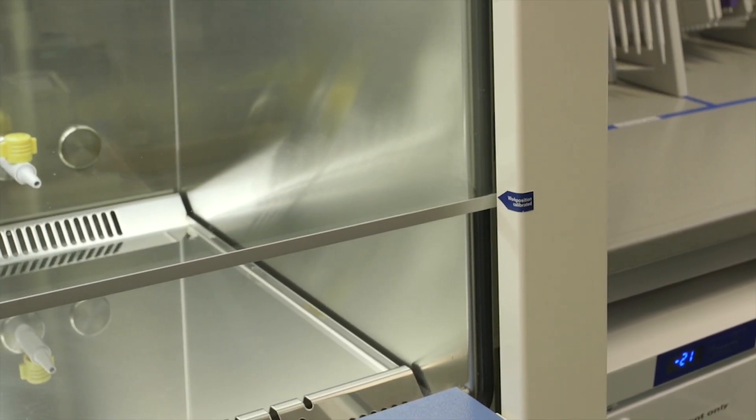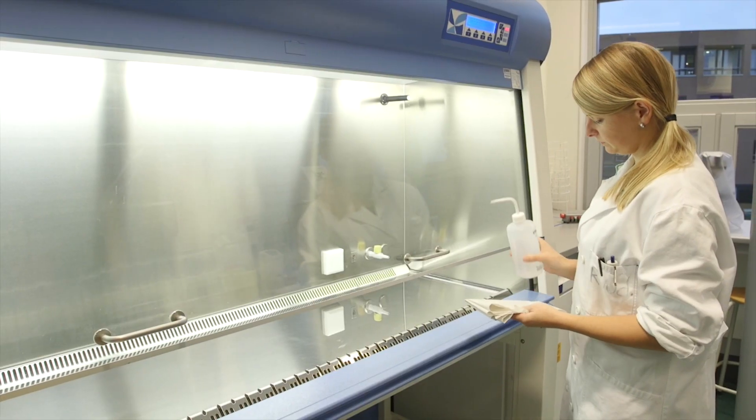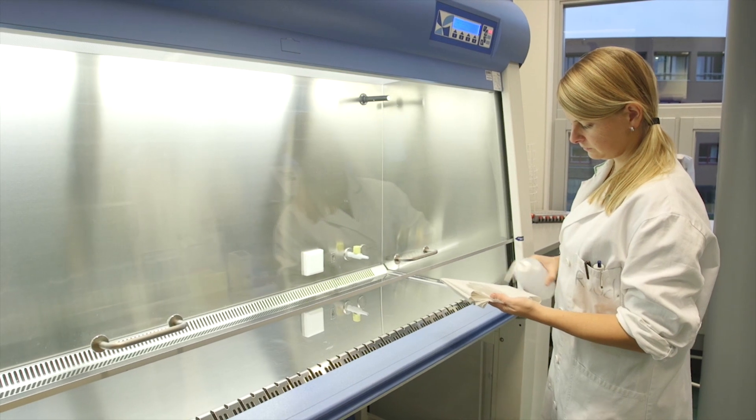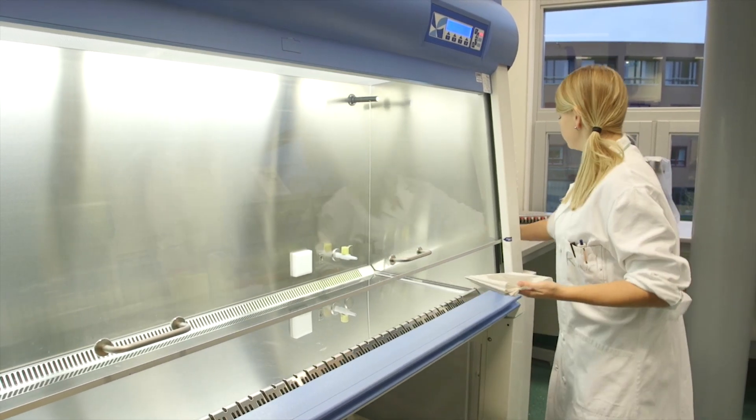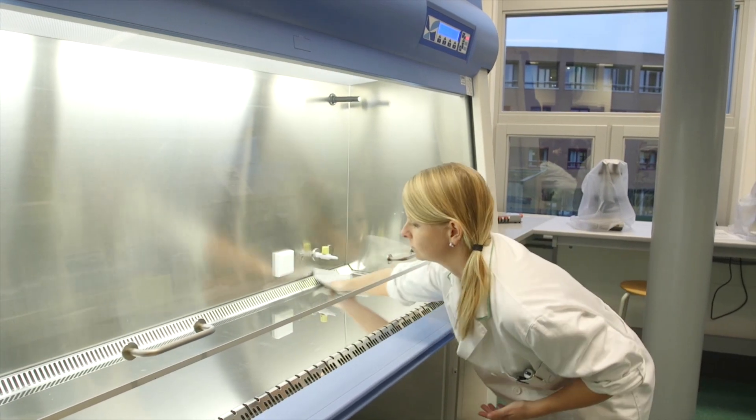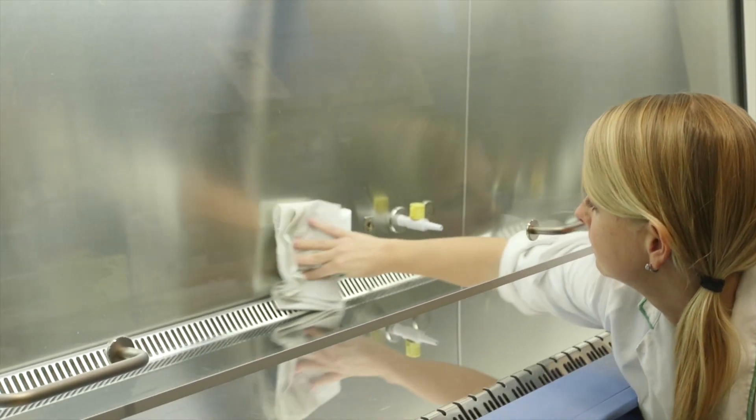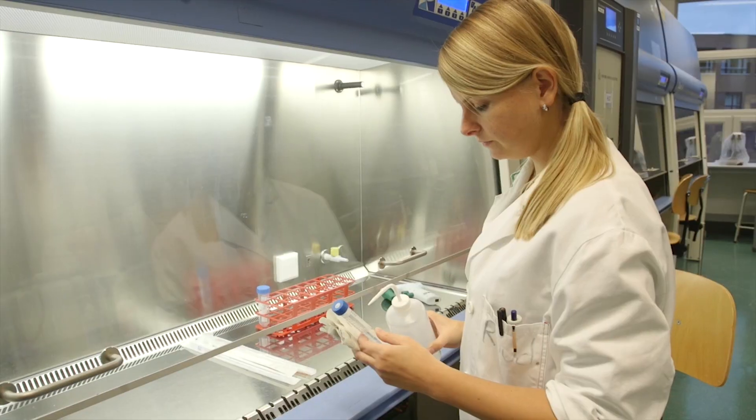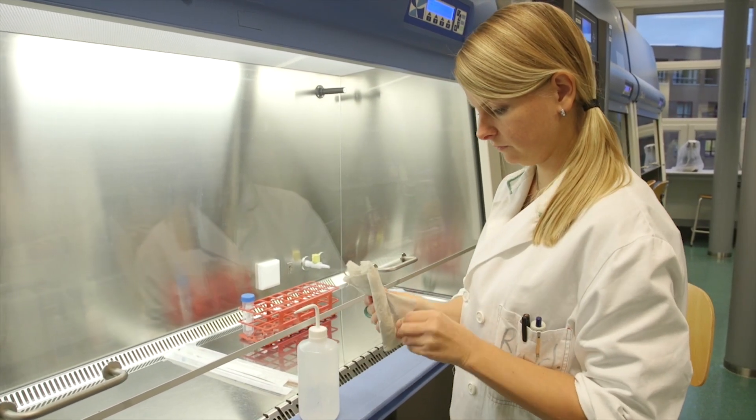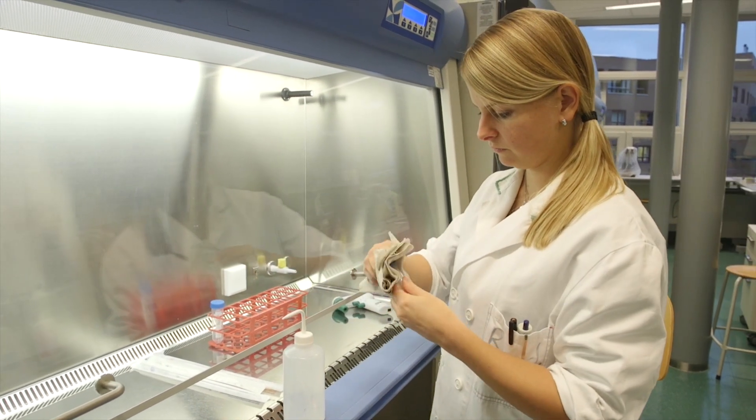Before you start using the cabinet, you need to disinfect the inside with 70% ethanol. The sleeves of your lab coat should be rolled up so they can't contaminate the surface. Work from the back to the front and don't forget the sides. All equipment should be disinfected with 70% ethanol before entering the flow cabinet. Ensure that your work area is well organized.